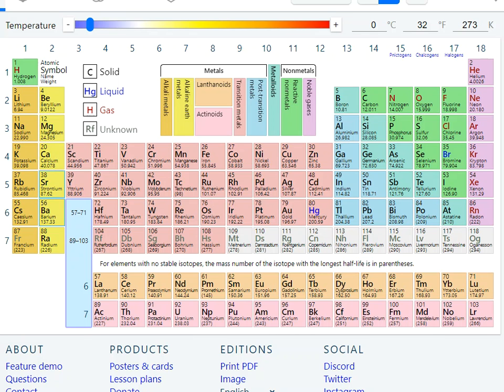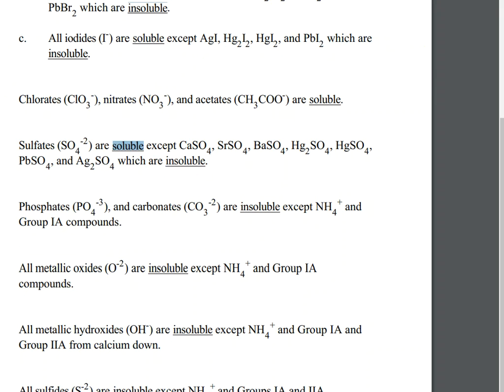They are clustered together right there in what we call Group 2 or family 2 of the periodic chart. Well, does this mean that calcium, strontium, and barium would be classified as a different group in the qualitative analysis world? Maybe. We'll see that, but this is where I need your mind to be as we go through and talk about a qualitative analysis scheme.